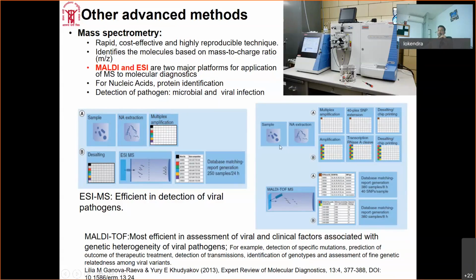In a multiplex reaction, various combinations of probes can be used to identify different types of SNPs altogether. These are two different methods, one identifying SNPs and the second just looking at the expression of genes.